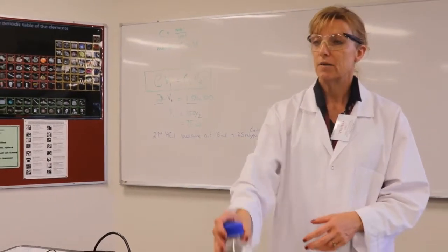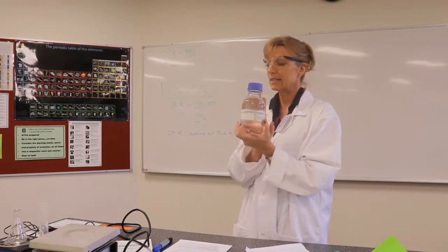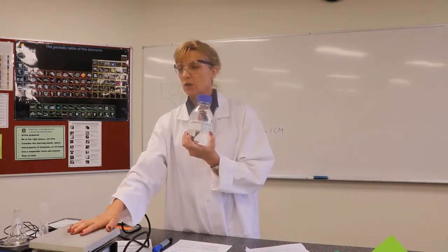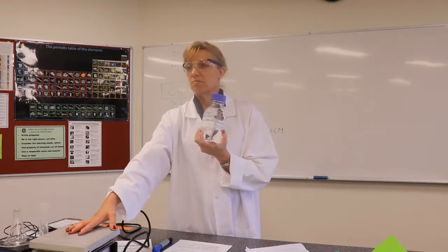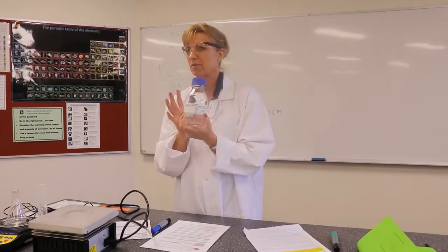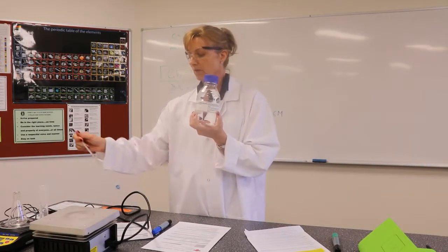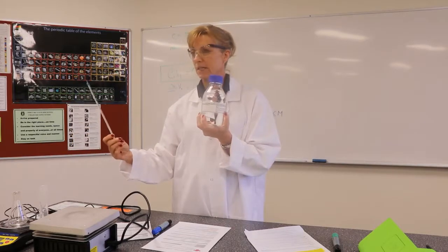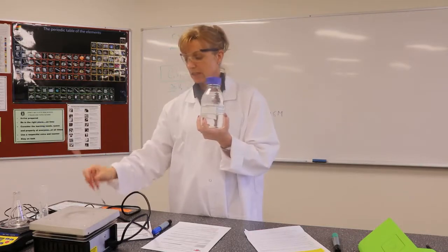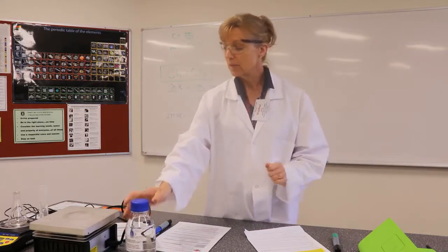You're going to change the temperature of your reacting solution. You've got to be very careful when you're heating acid. So in the lab we use these hot plates. At home, if you're going to use the stove, make sure you're using something that you don't necessarily want to keep, like an old pot or something. Be very careful not to overheat it. Just be mindful that acid is dangerous, and you don't want it spatting. Of course, you will have your safety glasses on, and you will be measuring the temperature with a thermometer. And that's the basis of this experiment.